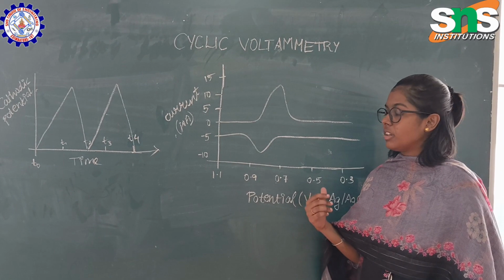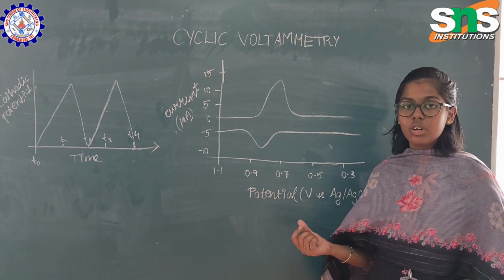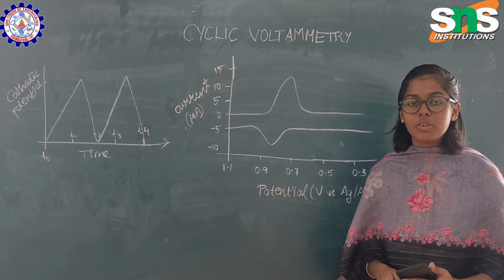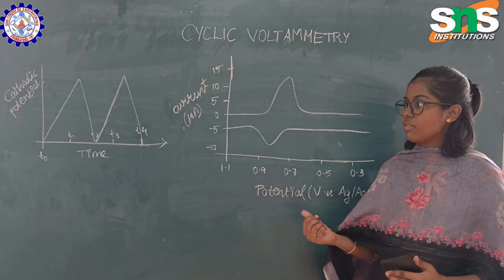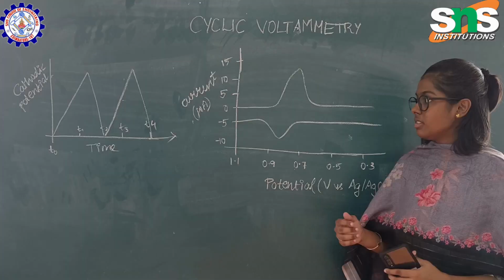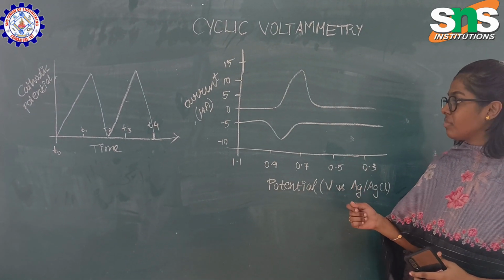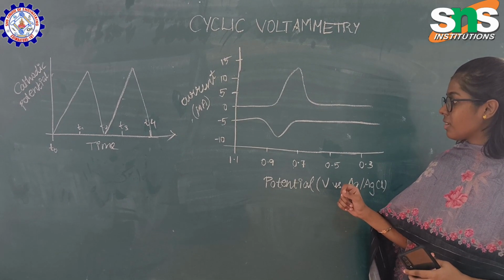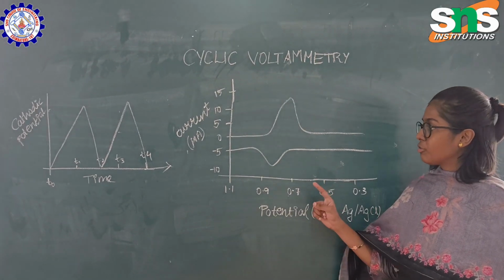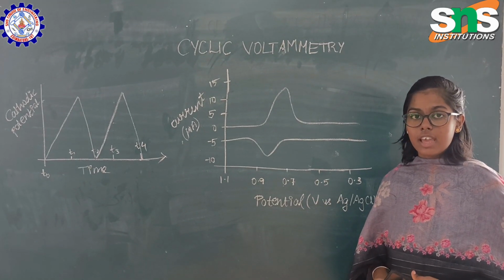Let me explain the cyclic voltammetry graph. The graph is plotted between the potential of the electrode and the current that is passed in the electrode. Unlike the linear sweep voltammetry graph, this graph has ramps that go in the opposite direction. These cycles of ramps are repeated as many times as desired. The rate of voltage change in these phases is known as the scan rate.